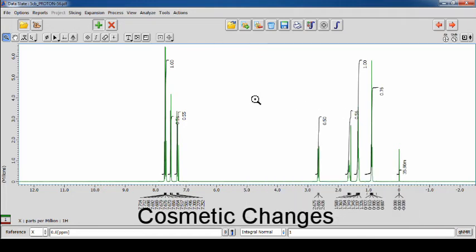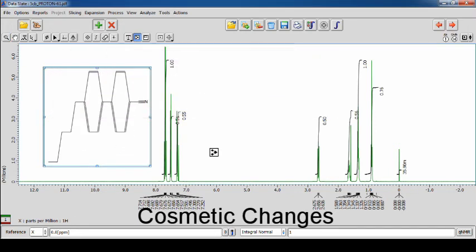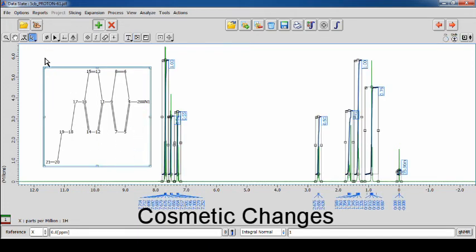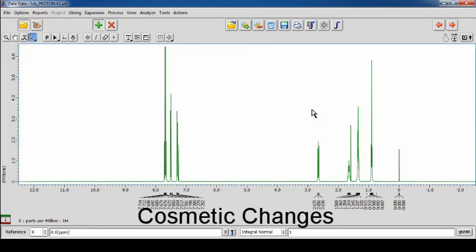To display molecule window atom numbers, hold Shift, Alt and A on the keyboard. To show or display the thresholds without selecting the adjust pointer, press Alt and T. To display or hide the peak values, press Alt and P.